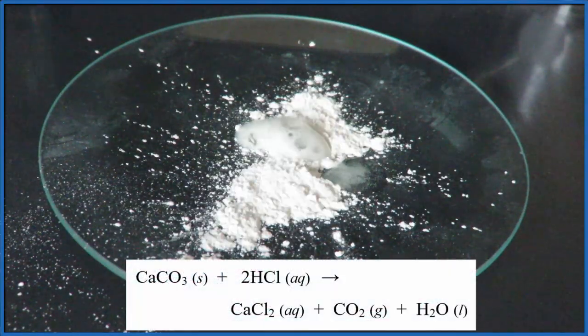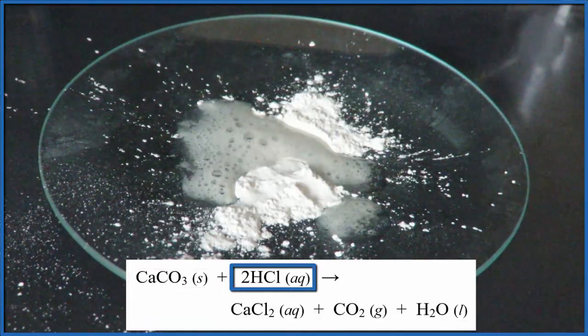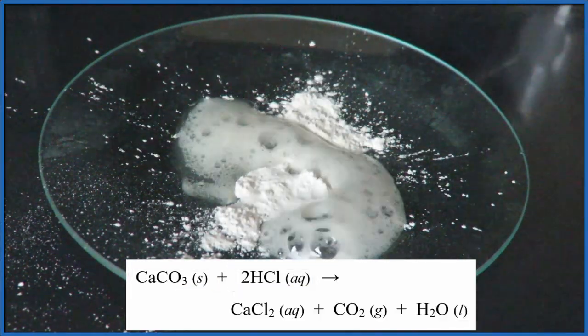Here you can see we have the solid, that white powder, that's the calcium carbonate, and then we drop the aqueous HCl, hydrochloric acid, right on that, and the reaction happens right away.